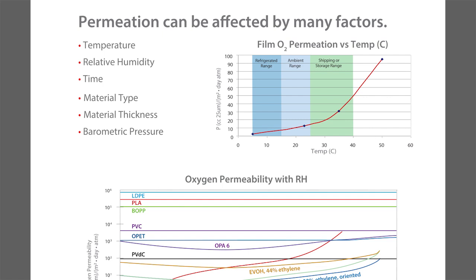Or are you concerned about how my cheese behaves, or my milk, or my refrigerated product behaves with the barriers and the packaging around it? If that's the case, then you look at testing at the temperature where it's really going to be stored. So that's always a debate: what temperature should I test this property of permeation? It's an important choice here.